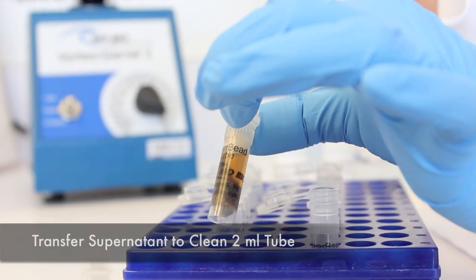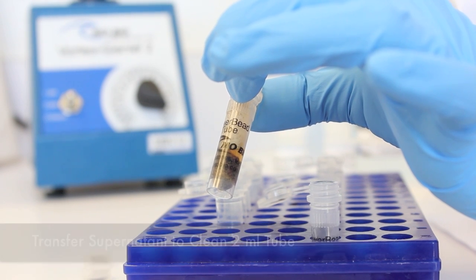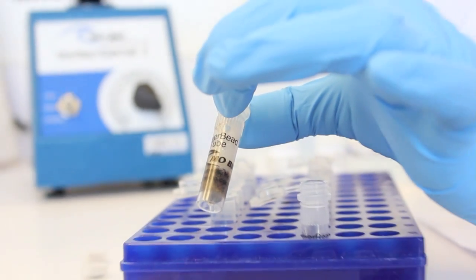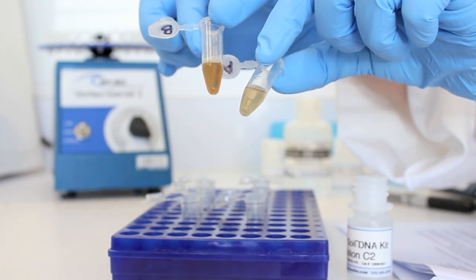Following centrifugation, transfer the supernatant to a clean 2 milliliter collection tube. You will have between 400 and 500 microliters of supernatant. The supernatant may still contain some soil particles. Carry-over soil or a dark color in the mixture is normal at this step.